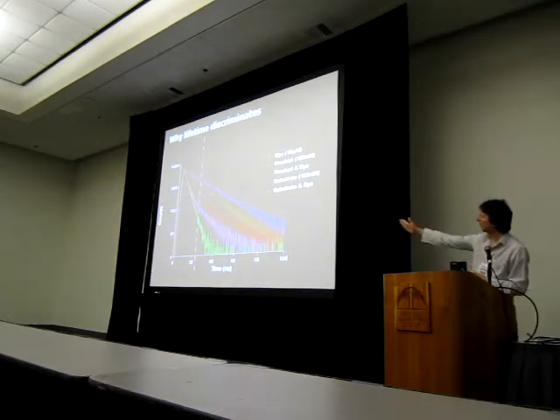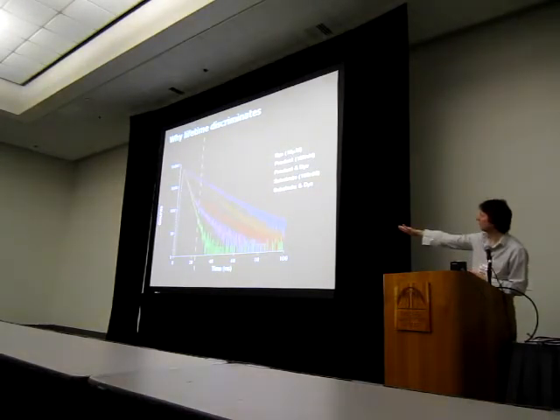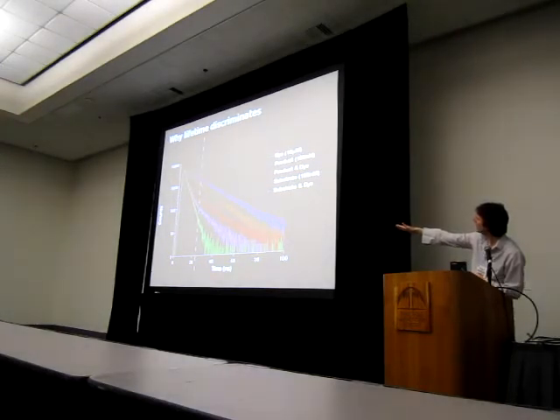So if you look at the slopes of the red line, which is the product and the dye, and you compare that with the slope of the blue line, which is just the product, to the right of that dashed line, you can see the slope is actually identical, isn't it? And the same is true of the substrate and the dye, the purple line, and the substrate, which is the orange one.